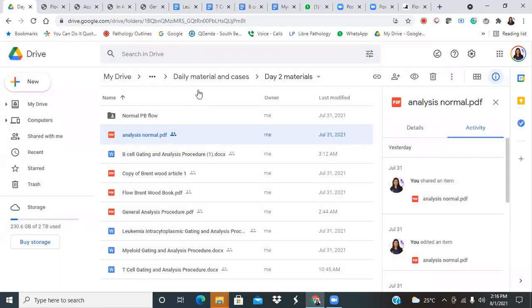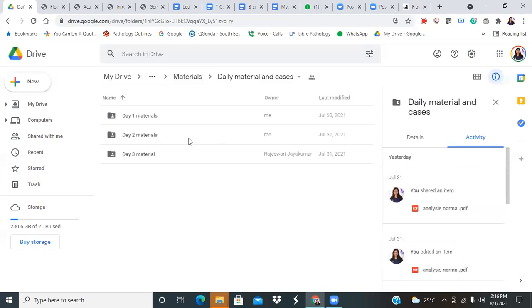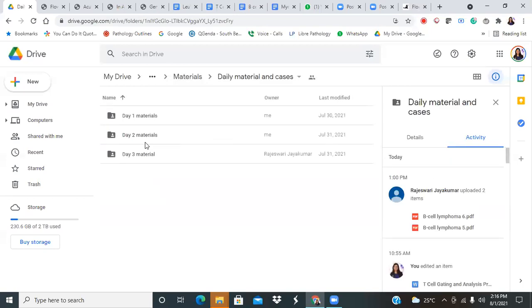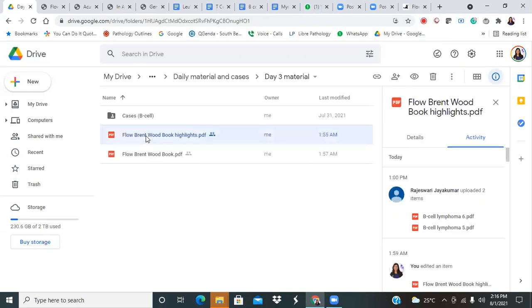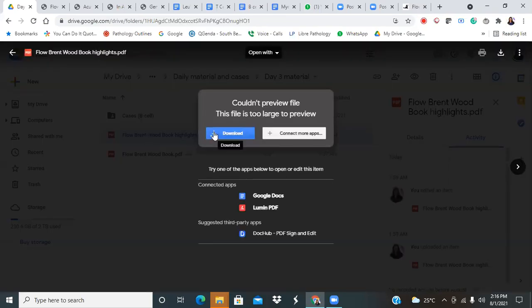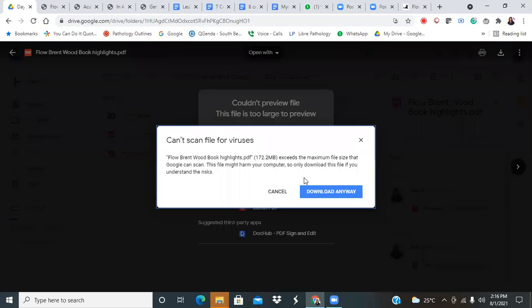Akanksha. Yeah. Question. So I was reading it somewhere. If you can clarify that when we have a diluted specimen, it becomes more of CD16 rather than CD13 and CD16 on a bone marrow.